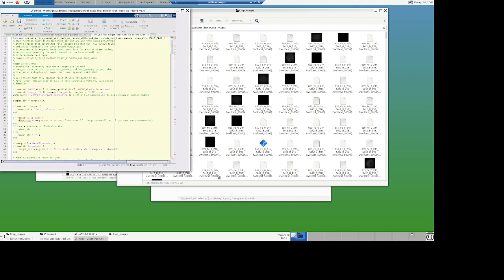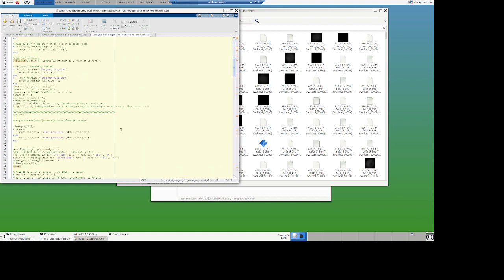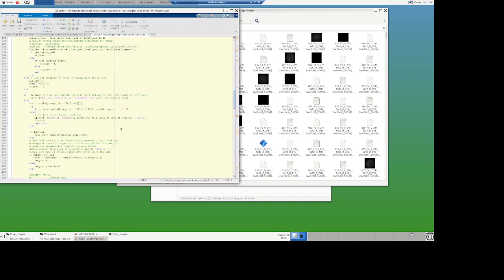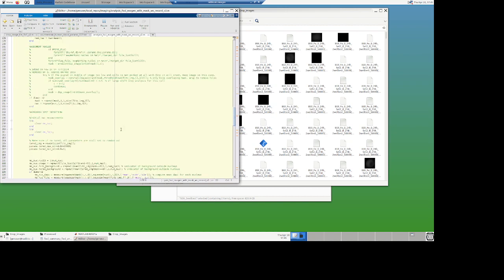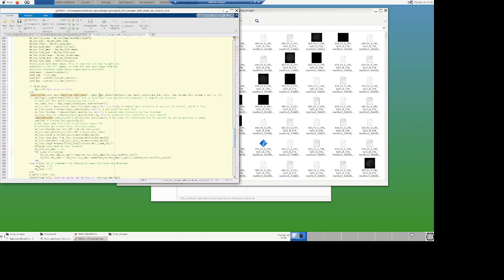So that's the code. That has some dependencies that you should have. All the functions that are used there are in the imaging directory, so you should be fine. The most important one is the spot detection. It's called James spot detection. James was my student at Berkeley.